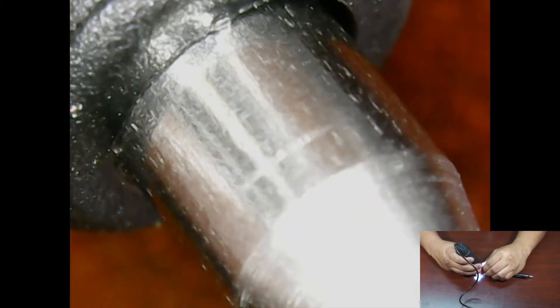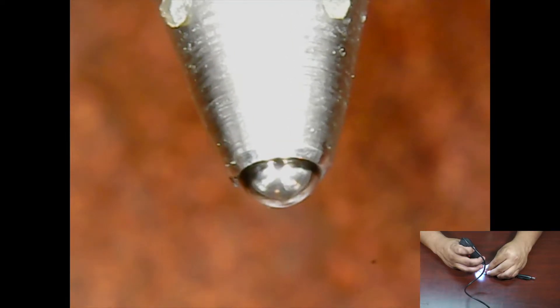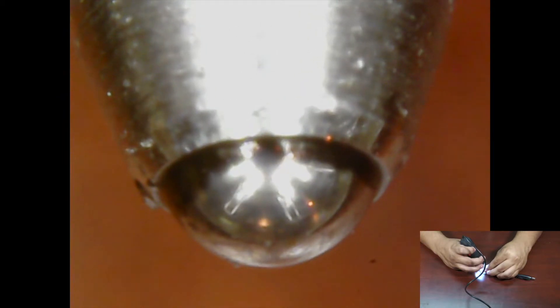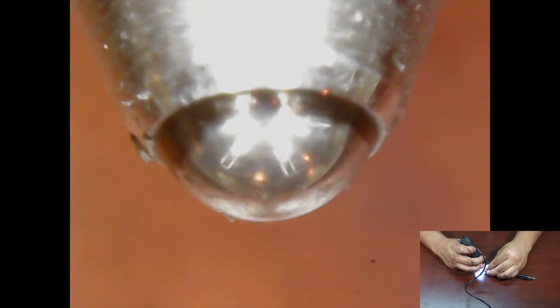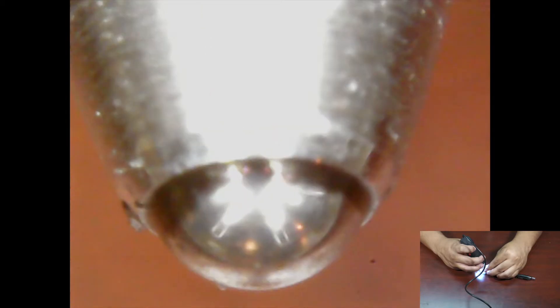Trying to find the pen — this thing looks really big under a microscope but in real life this thing is puny. That is the tip of a ballpoint pen. Now let's zoom in a little bit more. Crazy — that's the tip of a ballpoint pen. My thing is, how do people make these? They obviously manufacture these in bulk, but how did they get this little teeny ball on the tip? I don't know why, but this kind of gives me chills — how tiny this is but it looks humongous.